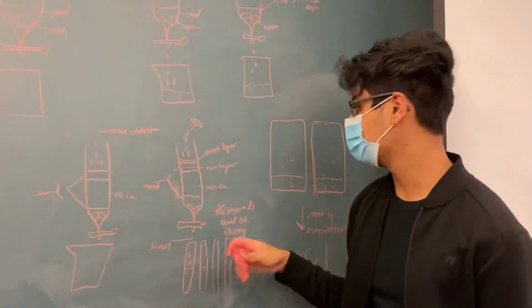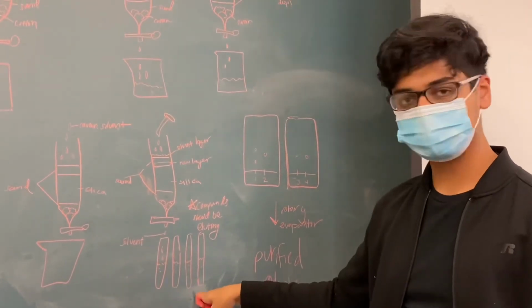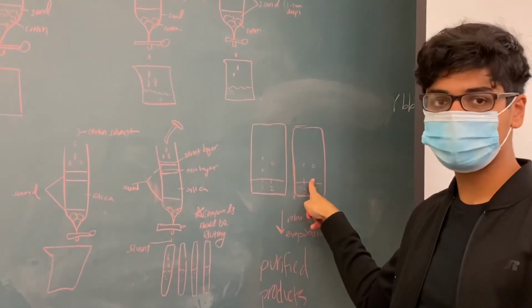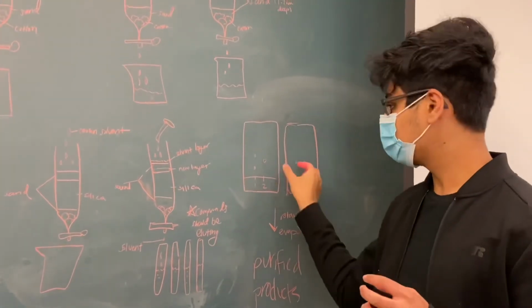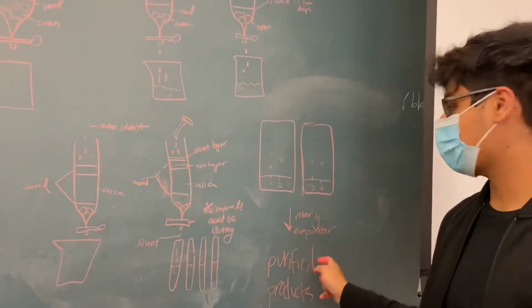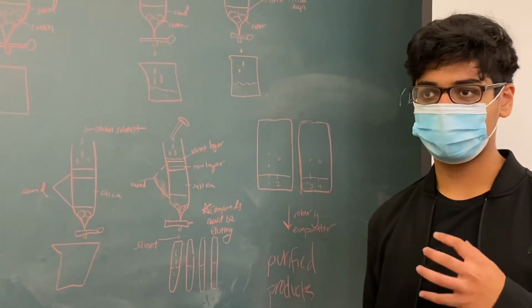Next, you perform thin layer chromatography on all the test tube solutions, and then you analyze your results, and whichever ones have one spot on them, those are the ones you're going to use. You're going to combine the solutions that have the one spot into one big test tube, and put that into a rotary evaporator, so that it can separate the solvent, and then afterwards you get the products. That's it for now.